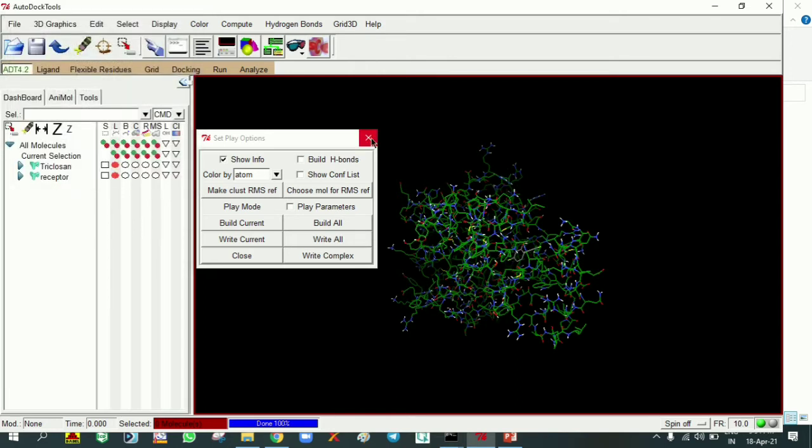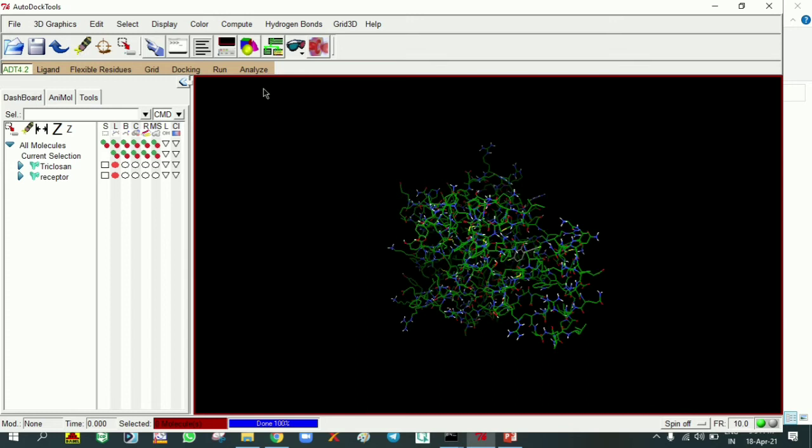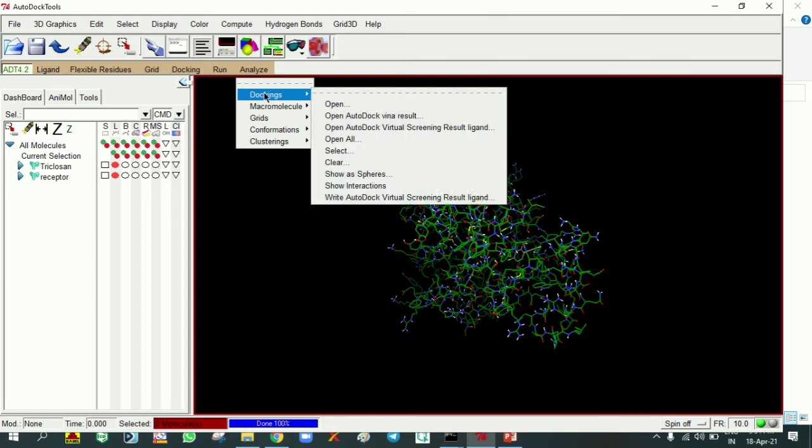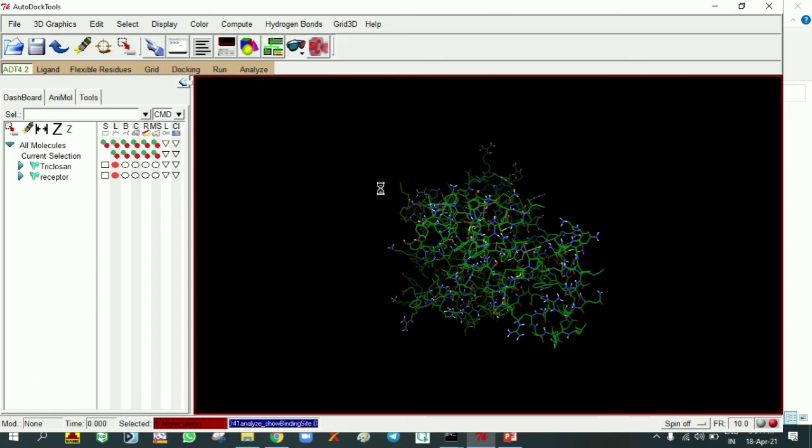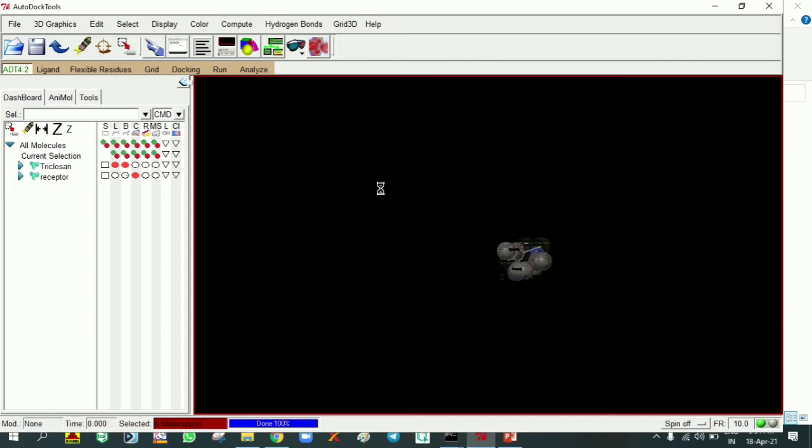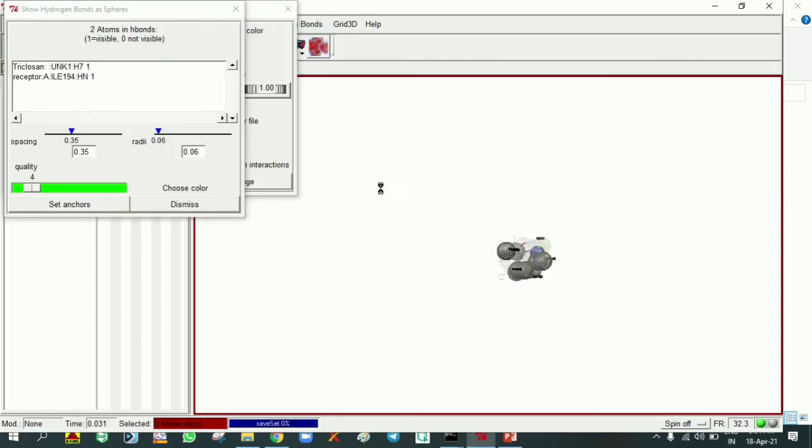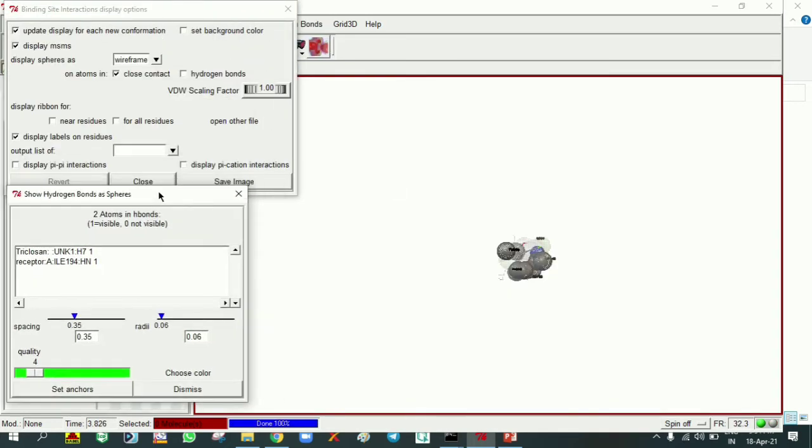These are the 10 results we are getting: docking result and inhibitory constant. We can visualize interactions in AutoDock, but we cannot see clearly in AutoDock, so we can choose Discovery Studio for good visualization.